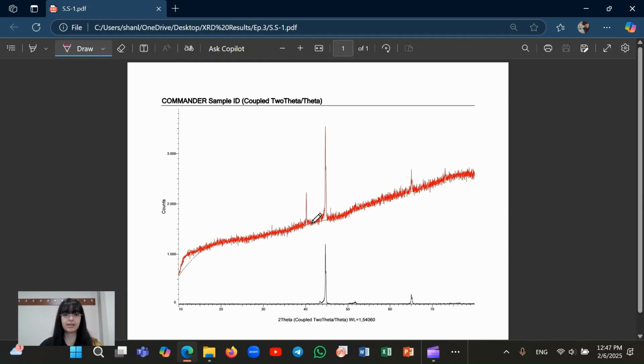You can clearly see the peak, which is related to the K-beta radiation, but you cannot find this peak in the black diagram. So this proves that this detector totally removed this peak, which is related to the K-beta, with only about a 20% loss in intensity, even when operating under high resolution and high count rate conditions.